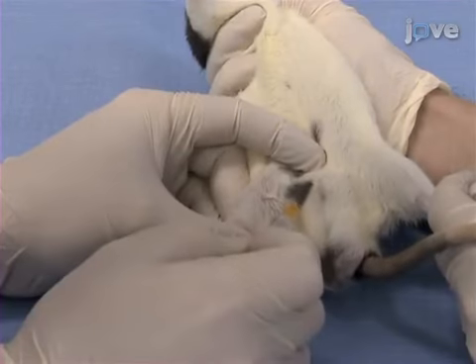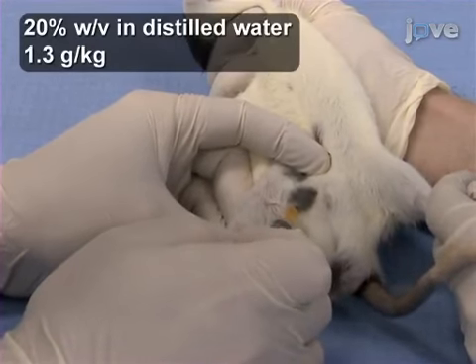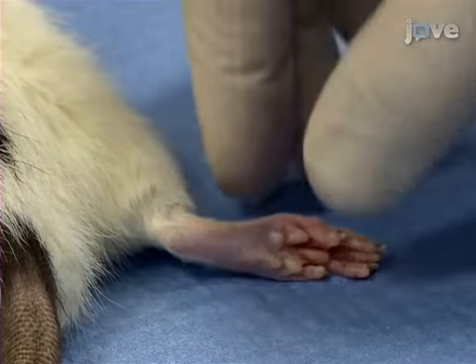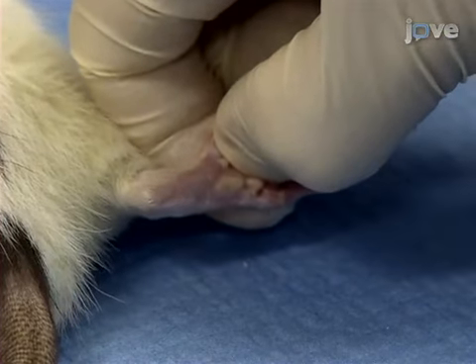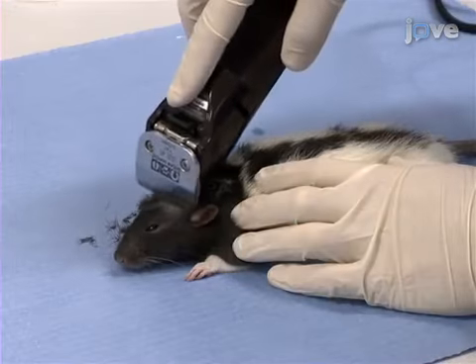Begin this procedure by anesthetizing a rat by IP injection of urethane. Ensure the anesthesia onset by testing for a toe pinch withdrawal reflex. If anesthesia is not sufficient, supplementary doses of urethane should be administered. Next, shave the head of the rat.